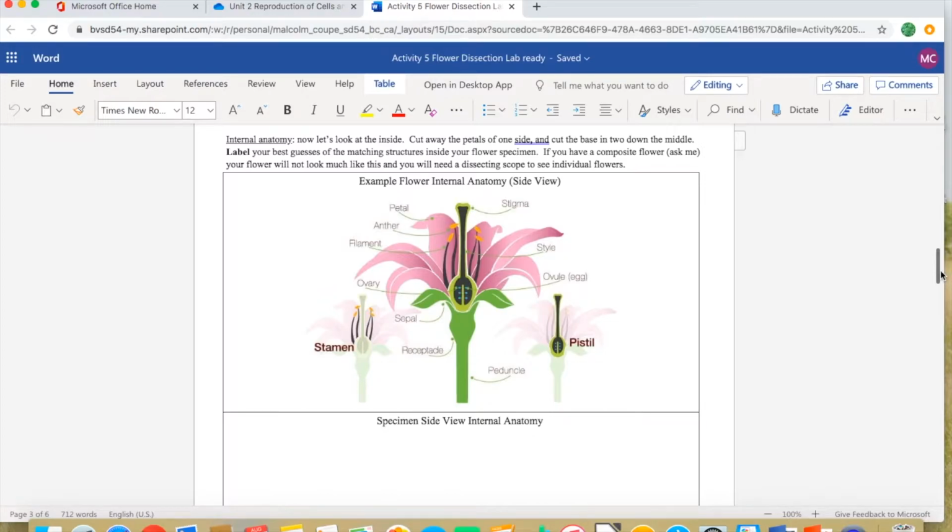I'll start with the basics: flowers are organs for sexual reproduction by what are called flowering plants, also called angiosperms. Flowers look very different from one flower to another, but they actually have a lot in common. Most flowers, though not all of them, have both male and female parts. The male and female parts are shaped differently, and the petals, flower sizes, and colors are different, but the male and female parts, when they're present, have names that I'd like you to become a little more familiar with.